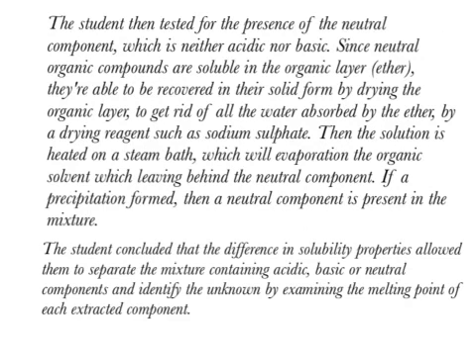The student then tested for the presence of the neutral component, which is neither acidic nor basic. Since neutral compounds are soluble in the organic layer, ether, they can be recovered in solid form by drying the organic layer with a drying agent such as sodium sulfate to get rid of all the water absorbed by the ether. Then the solution is heated on a steam bath, which evaporates the organic solvent and leaves behind the neutral component. If a precipitate forms, then a neutral component is present in the mixture.